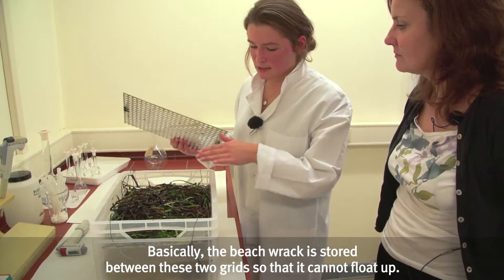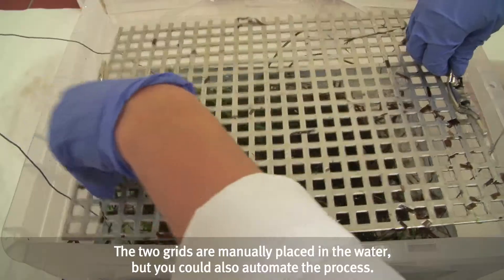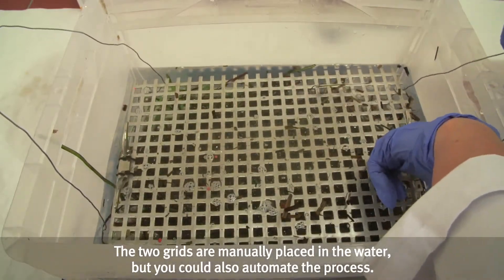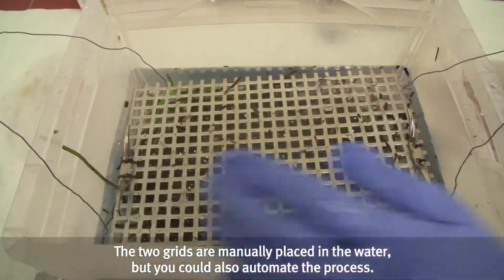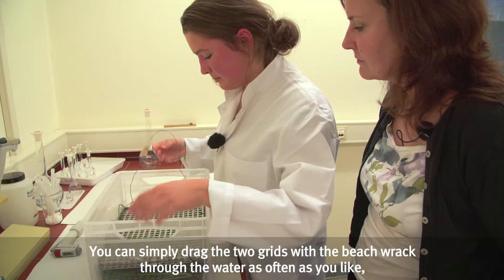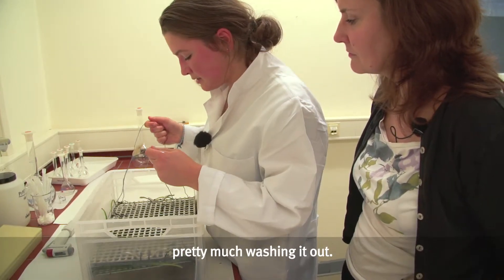It consists of two grids (Gitter), between which the drift material (Treibsel) is placed so that it cannot escape. These two grids are manually lowered into the water. One can automate the whole process, but I will run through it manually now. The two grids with the drift material are moved through the water repeatedly, essentially washing out the material.